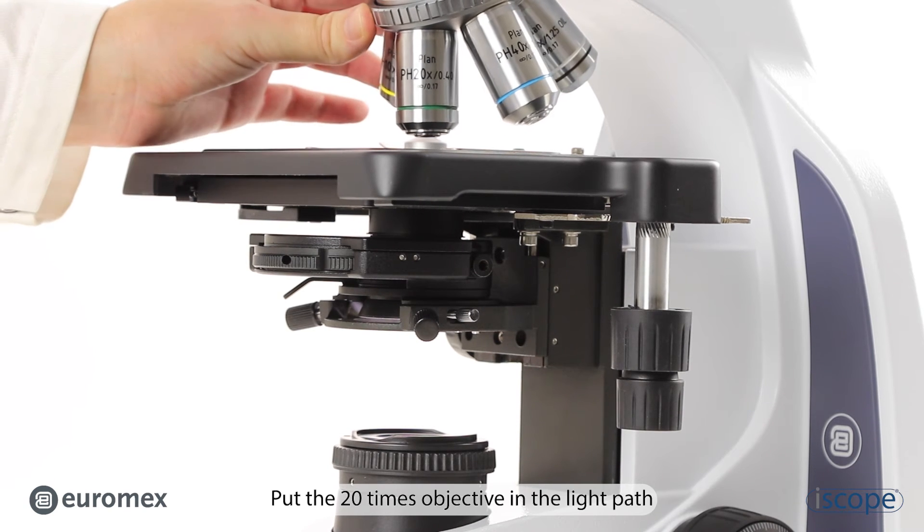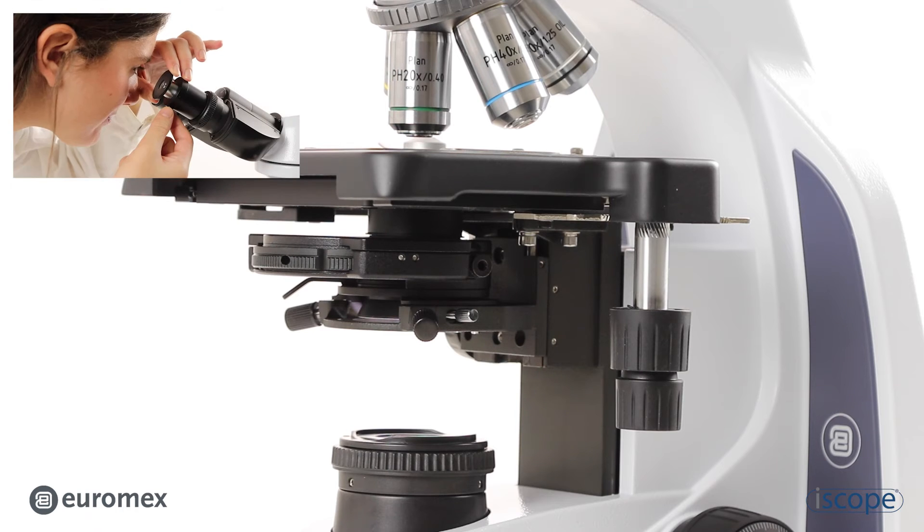Put the 20 times objective in the light path. Focus and center.